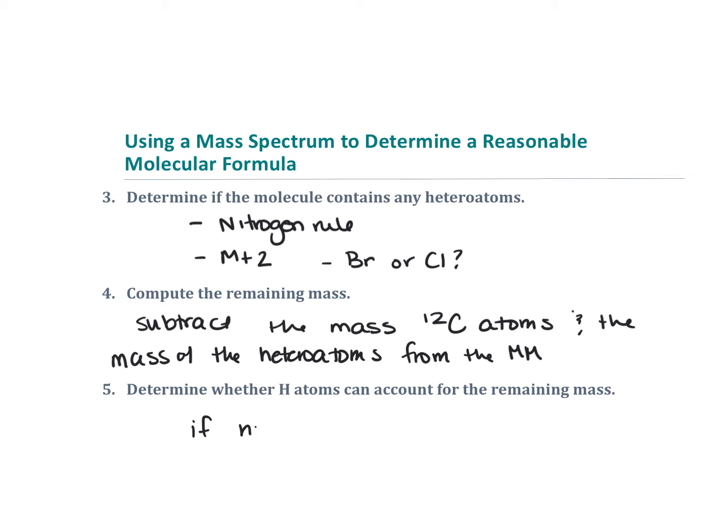So I'm going to put just here, if not, think about other heteroatoms, right? Like oxygen or fluorine, right? And then you can repeat that.